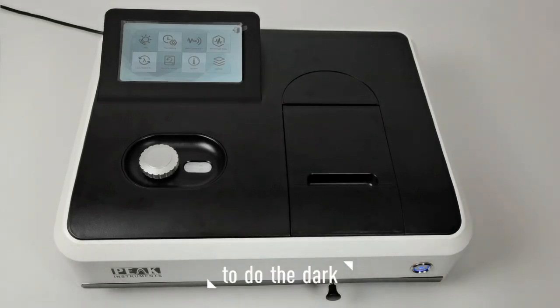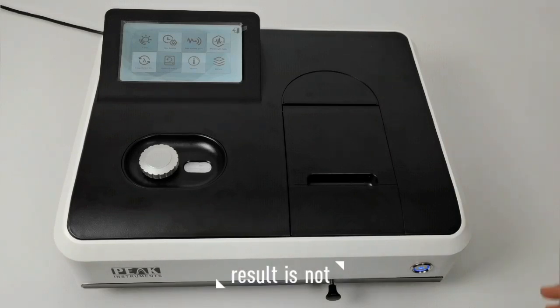Hello, this video will show you how to do the dark current calibration. If the test result is not as good as before, then you can try to do the dark current calibration.